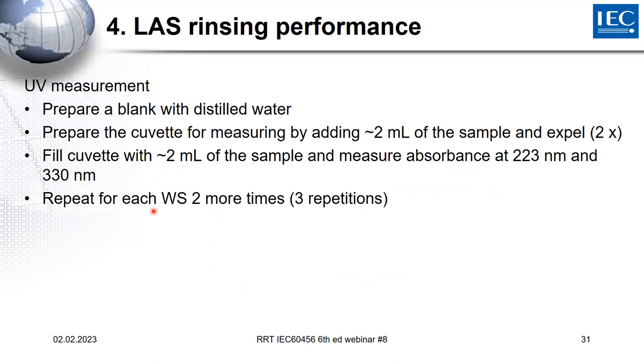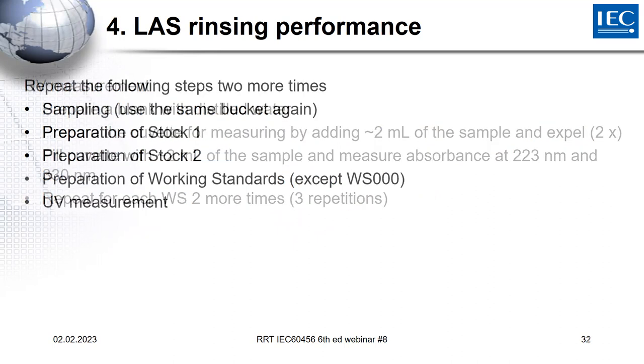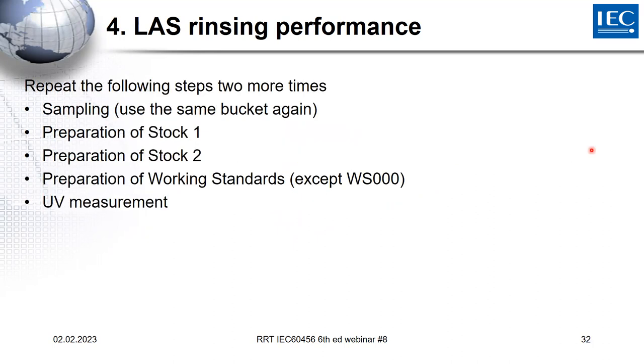And as I wrote here, you repeat it. You measure 3 repetitions per working standard for the measurement. If you are finished with this, you have done it once, so the 1 calibration curve.